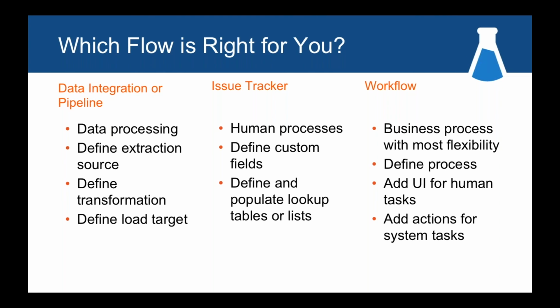So just to summarize, if you're looking for a workflow within LabKey, there are various different modules that you can use. If you are doing solely data processing, you probably are looking at the data integration or pipeline modules. And for that, you would define the extraction source, you define the transformation that you need to do, and you define the load target.